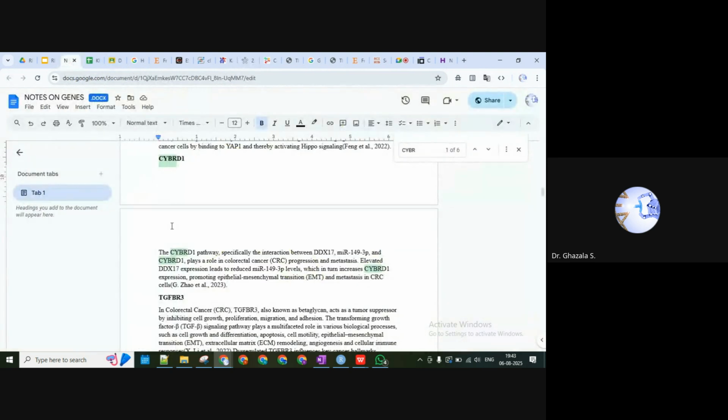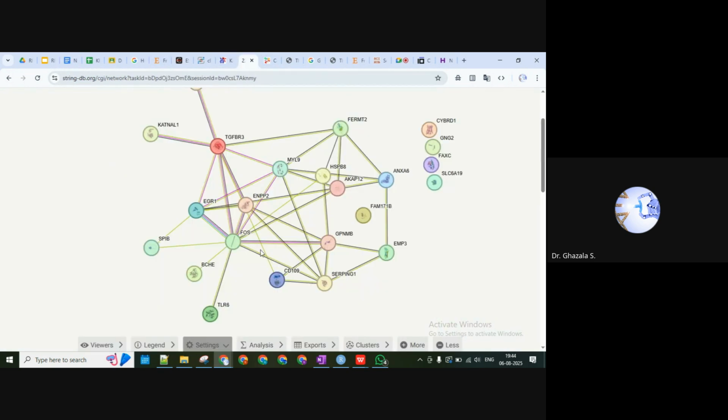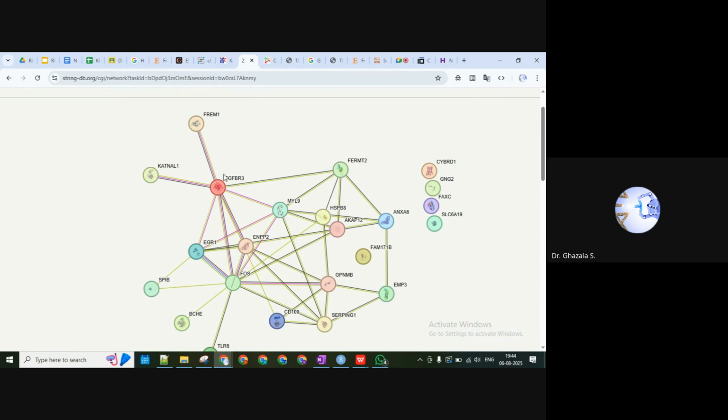So in your list, you can check any other gene which is known, maybe TGFBR3 that is here, and we can see how it is connected with BCHE. Okay, so now we need to study this particular connection. And where is TGFBR3? Yeah, here we have it. So if the gene expression of TGFBR3 is affected, it can affect the expression of FOS, and FOS will affect the expression of BCHE.